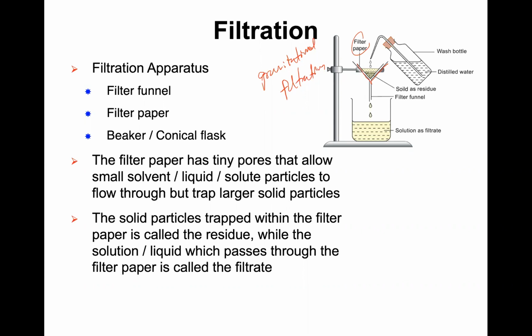And here at the bottom is clear, and you see those particles will stay here, because the filter paper generally is a piece of paper, and there are many holes on the paper. And typically we want the holes to be uniform in size. So the hole sizes are similar, or even if not exactly the same size, very close to each other. The size of the hole, we call porosity. We talk about the diameter of the holes.